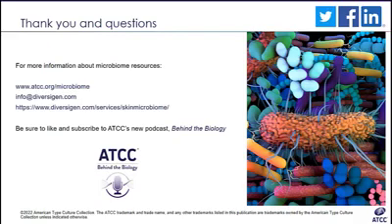Okay. And what's the biggest challenge, do you think, in WGS shotgun sequencing for skin? Is it low bioburden? Yeah, that's a great question, and I think we probably cover some of it in the Q&A at the beginning. One of the main challenges is the high host content, and also trying to get to that sweet spot of the sequencing depth, which is going to be very important in skin microbiome and shotgun sequencing.